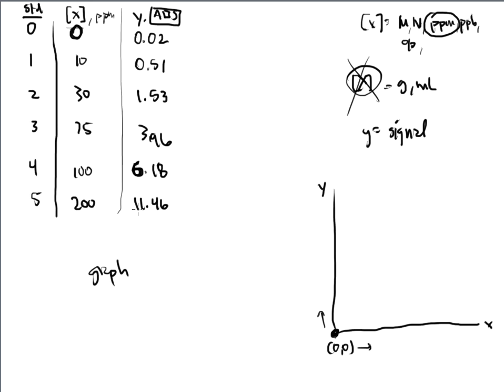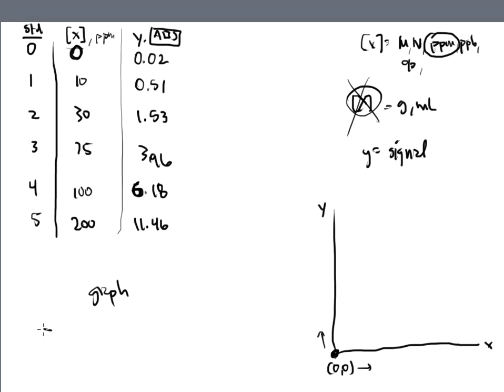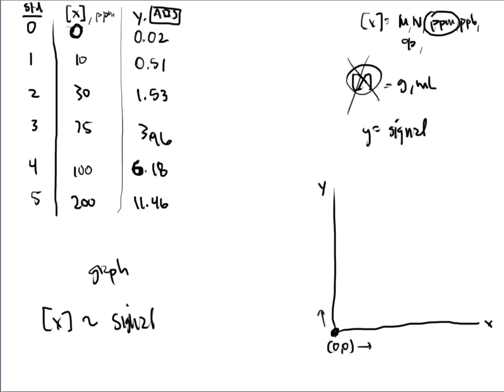So it's my job to do a calibration curve. And the purpose of the calibration curve is to figure out how the concentration relates to the signal. That's the whole job. That's the whole purpose of this calibration curve.